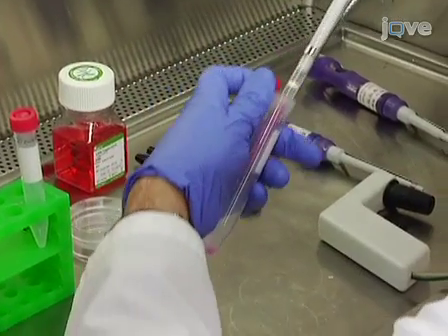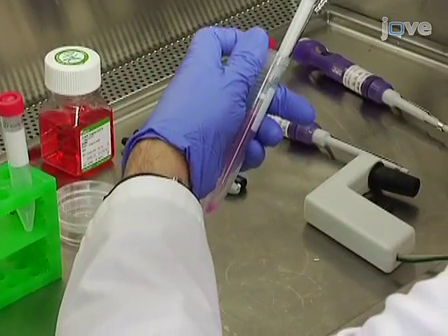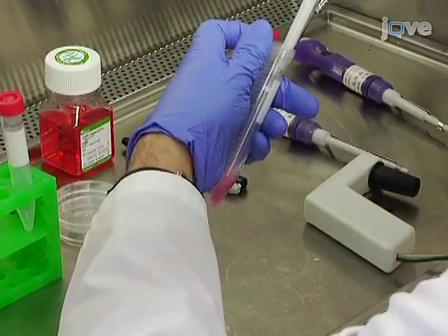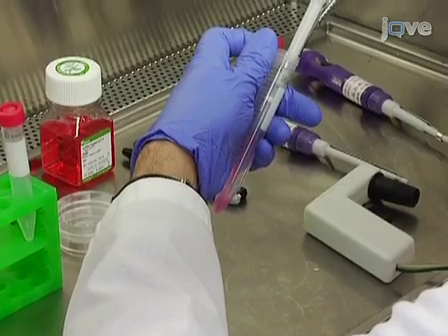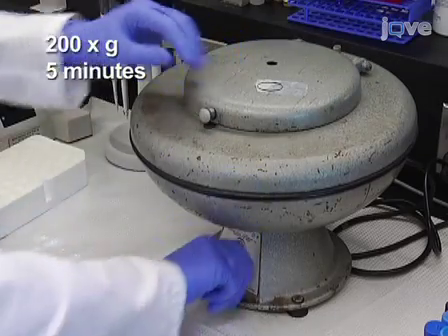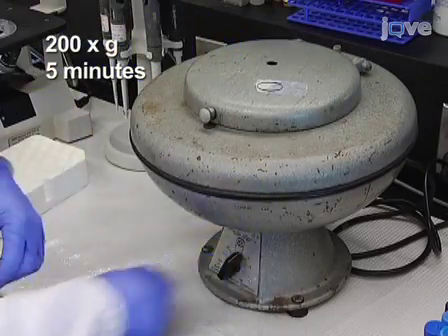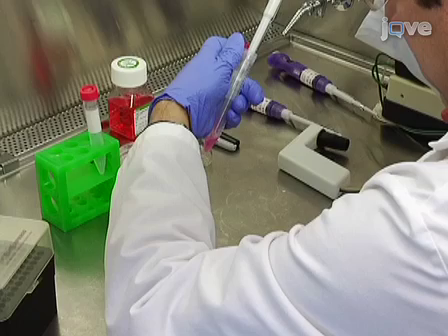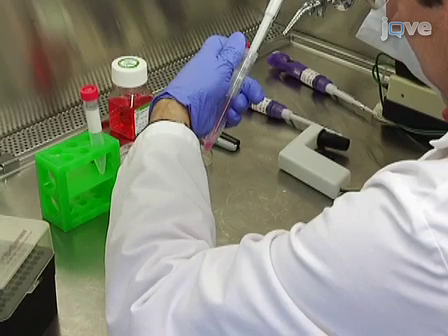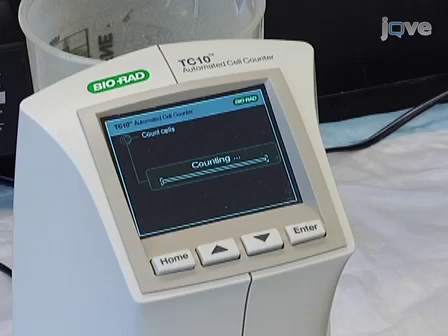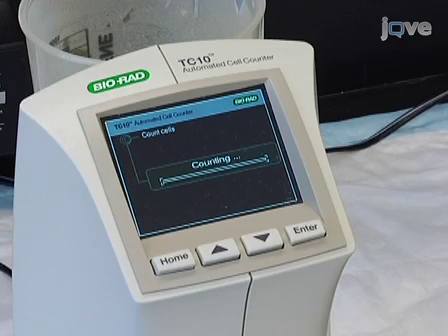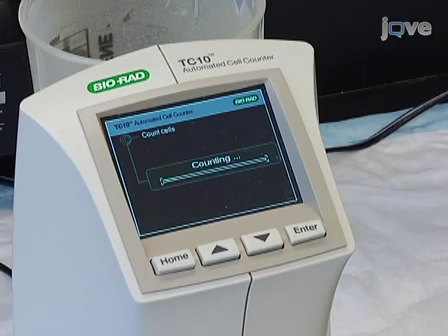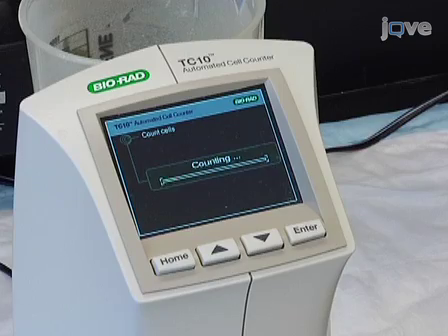Then resuspend the pellet in 1ml of complete medium to wash. Repeat the centrifugation and resuspend the pellet in 1ml of complete medium. Next, perform a cell count using an automated cell counter or haemocytometer.